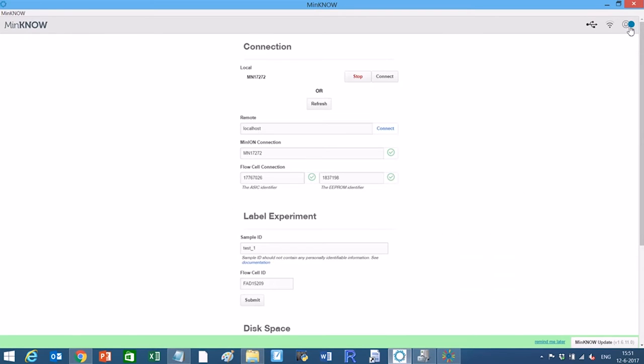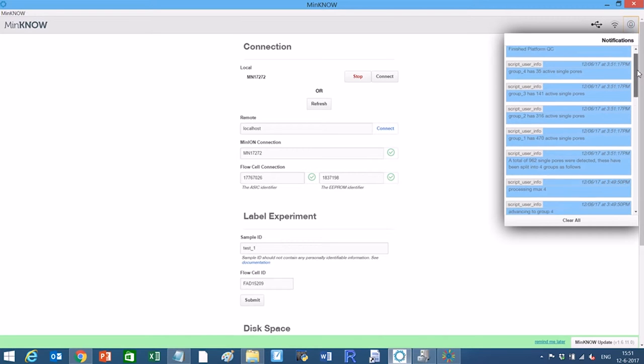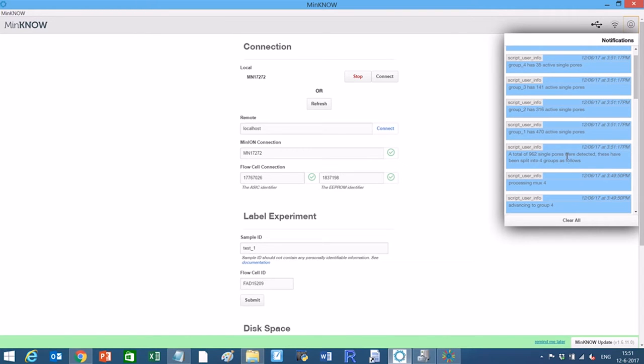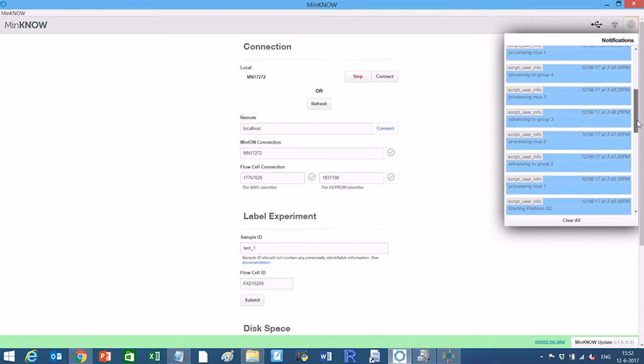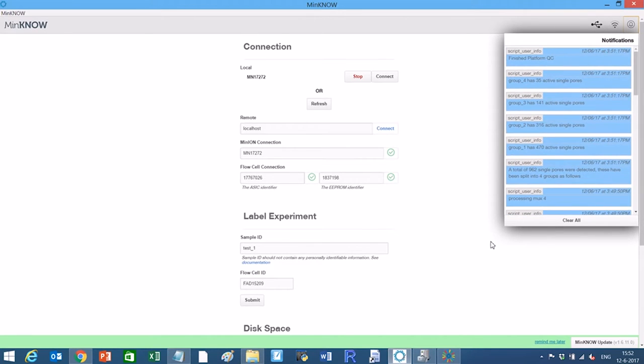Active ports are reported in four groups, each of which may be used in turn when running long experiments, example, a 48-hour sequencing run. Shorter experiments will use fewer than four groups.